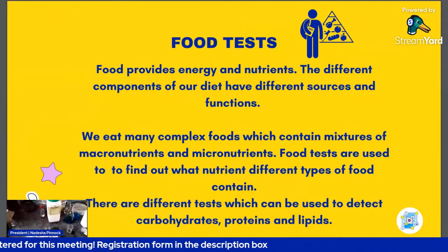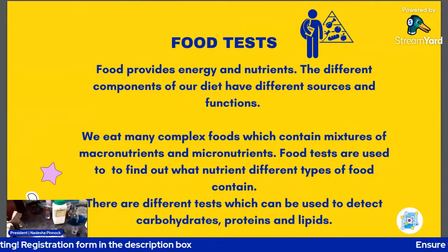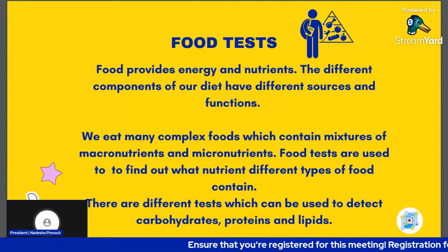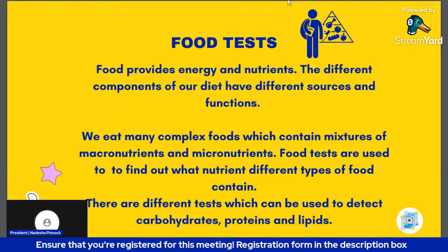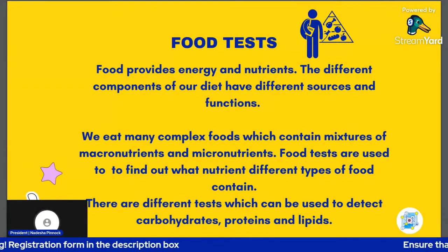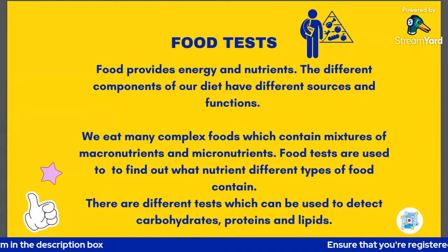So we're doing food tests, and we know that food provides energy and nutrients, and the different components of our diet have different sources and functions. We know that lipids, proteins, carbohydrates, they all have different functions. And we eat many complex foods which contain a mixture of macro and micronutrients.